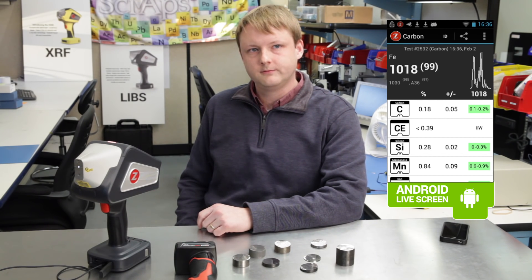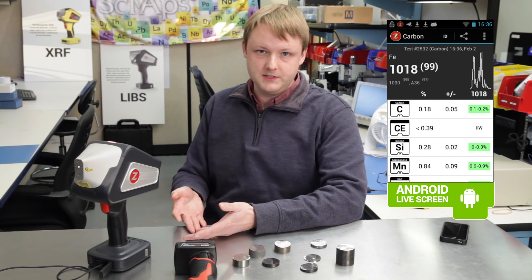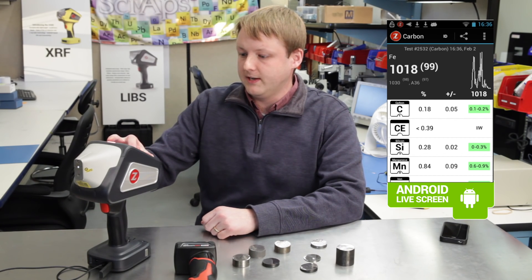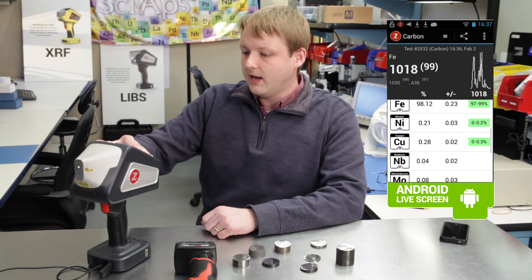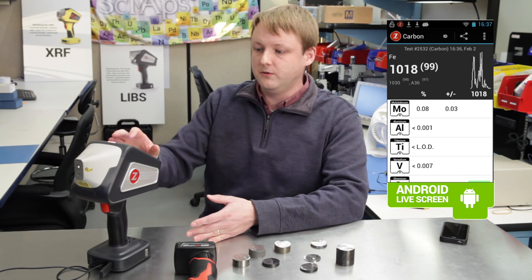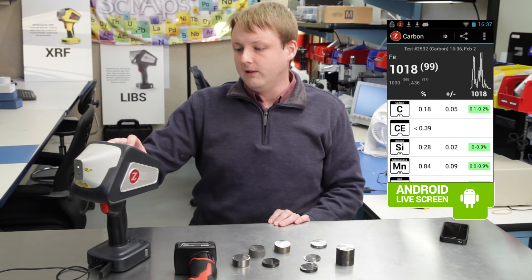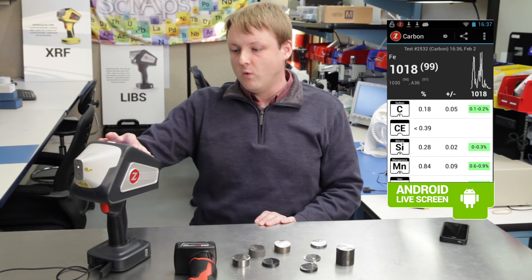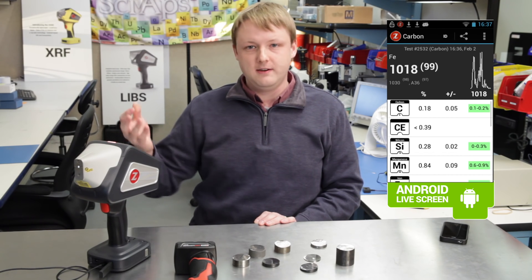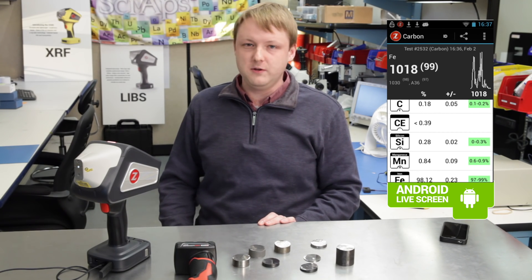We're calculating the carbon equivalence based on the results for a few other elements. Even though this is carbon mode, we're doing a full elemental analysis of all the other elements that commonly show up in low alloy steel — silicon, manganese, nickel, copper, moly, and vanadium. We use all of those to plug into the carbon equivalence formula to report the total carbon equivalence reading. If one of those elements that gets plugged into the formula is a non-detect — like vanadium in this case — we'll just put a less-than sign in front of the carbon equivalence to show that's the maximum value we would expect. The real value might be less than that.